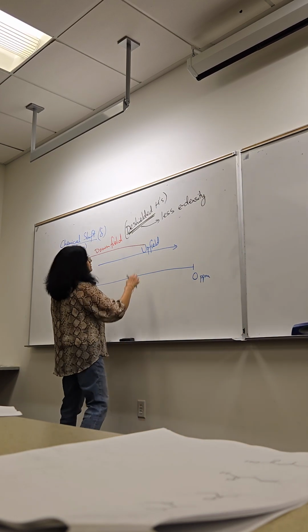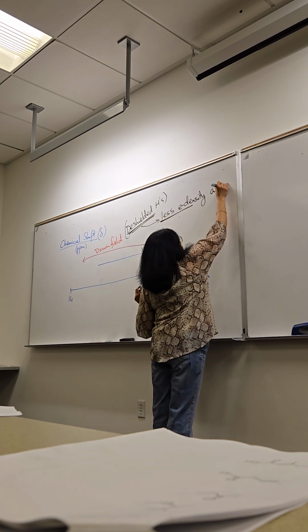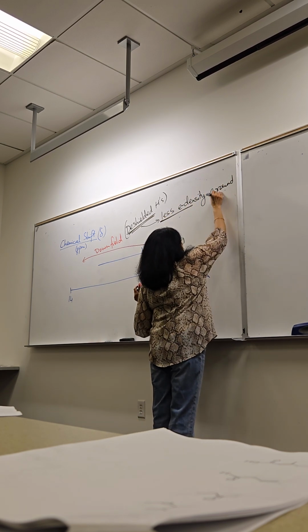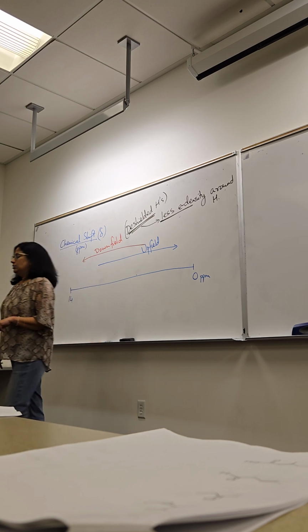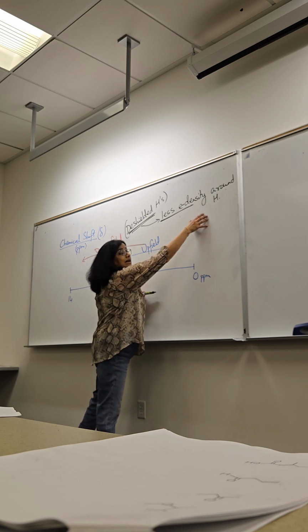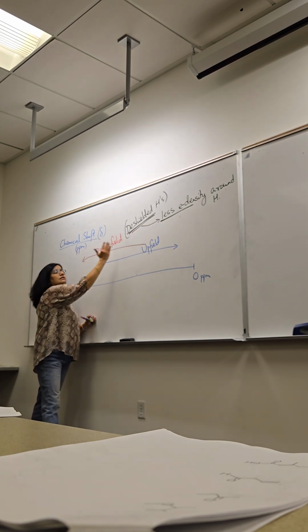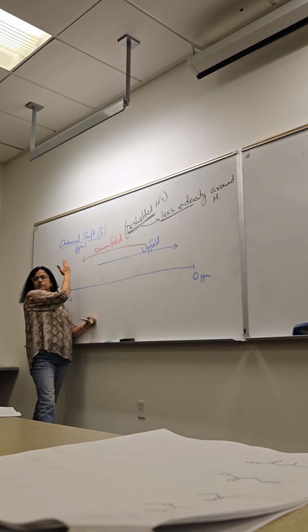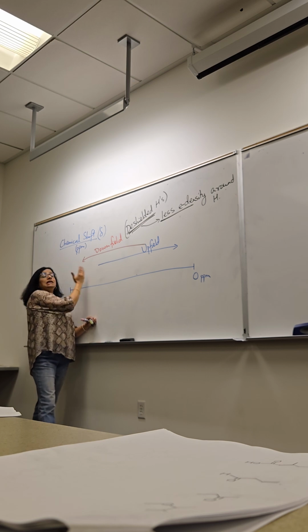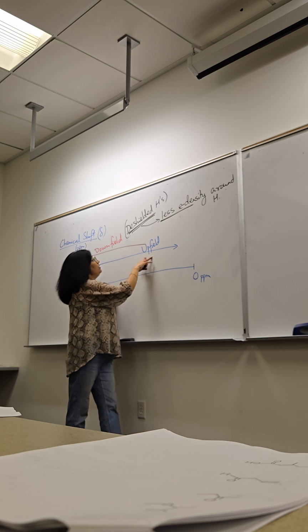So the point is, the less electron density around the hydrogen, since in proton NMR spectroscopy we are focused on hydrogen, the more de-shielded it is, the more downfield the signal shows up, meaning higher ppm values. The opposite is for upfield.